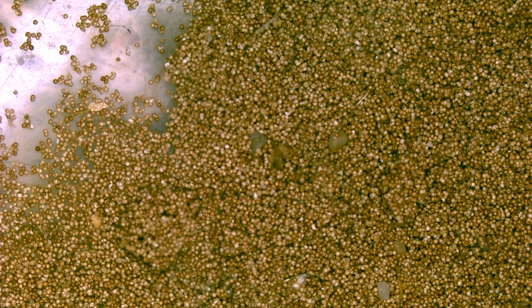But in rough conditions, the survival strategy is to breed cysts. So cysts are basically eggs, a dormant artemia. And that's what we use here at the lab to culture out our nauplii.